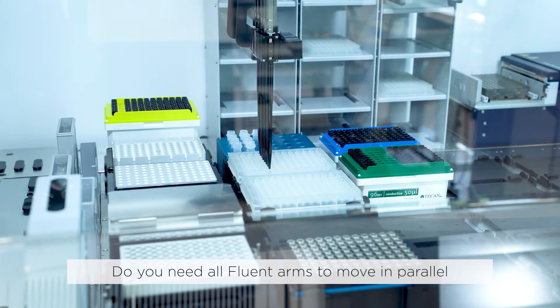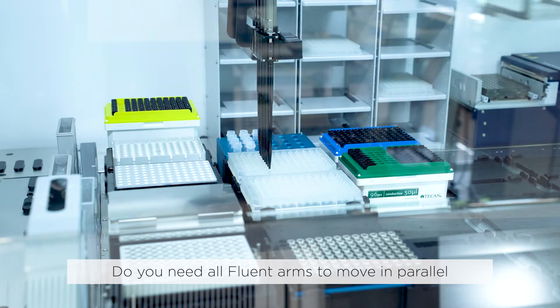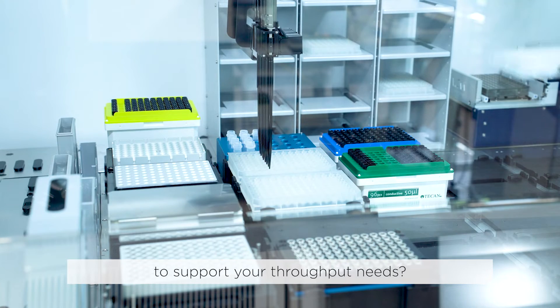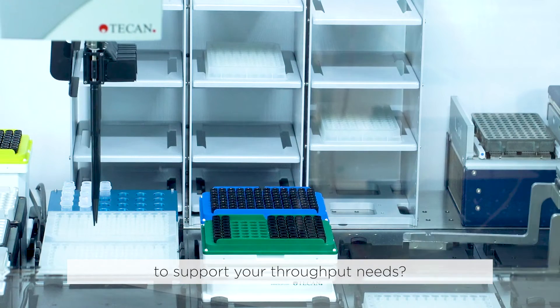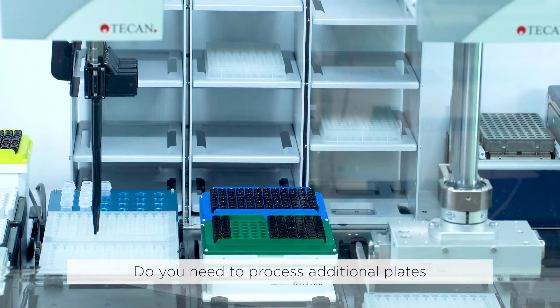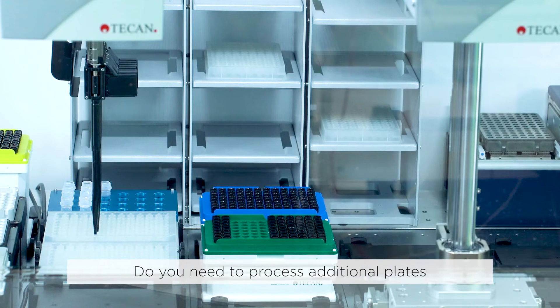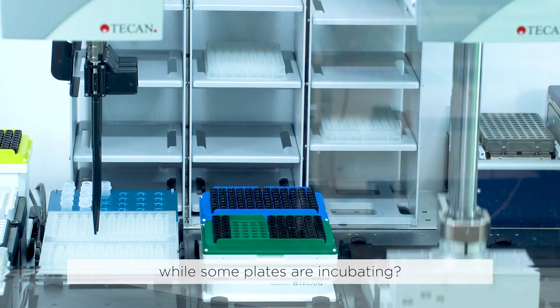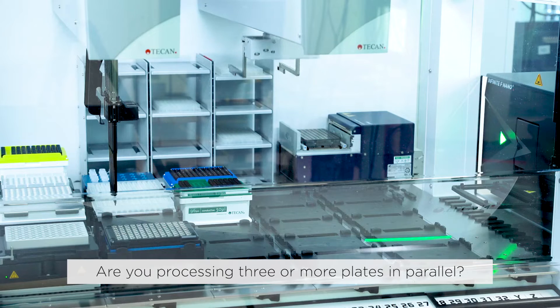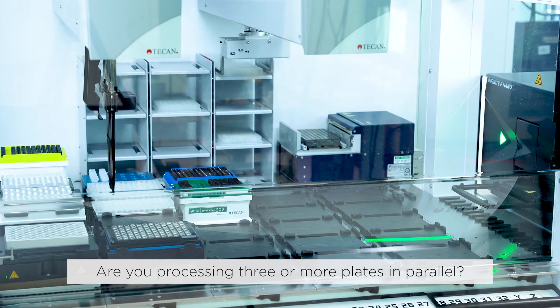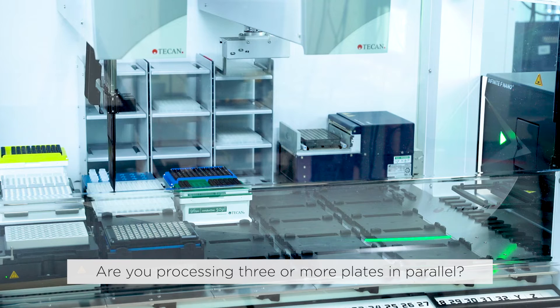Do you need all Fluent arms to move in parallel to support your throughput needs? Do you need to process additional plates while some plates are incubating? Are you processing three or more plates in parallel?